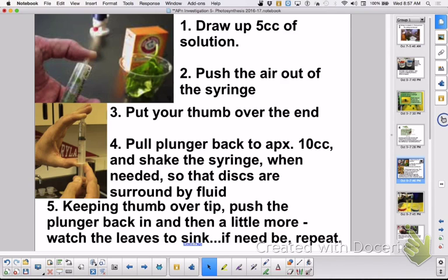Don't make this sudsy. It's water with a little bit of soap, and it will help the solution infuse better. And I just want you to put in 2 drops. You can go. It says 1, put in 2. That's it. No mixing, no nothing. It's good to go. Okay? Now this doesn't have any baking soda in it, right? Right. So I just did that tomorrow.